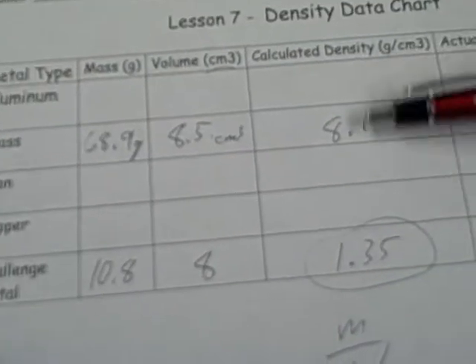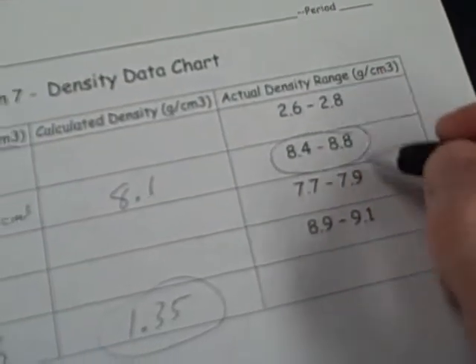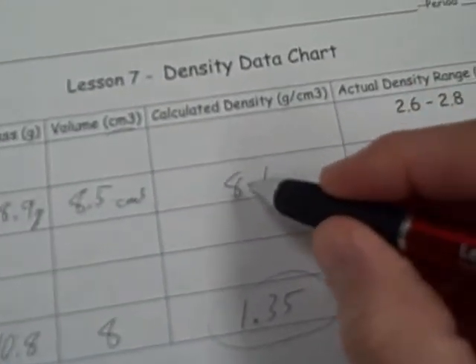See how close you get. If you're way off, you might want to retry to see where you went wrong, but try to get fairly close. This is the actual range that professional scientists get. You might get something close.